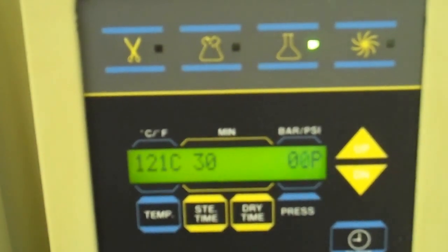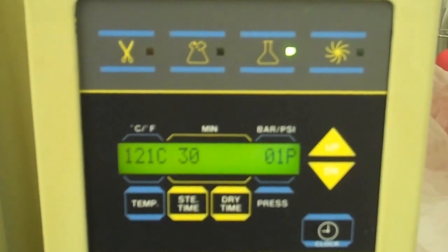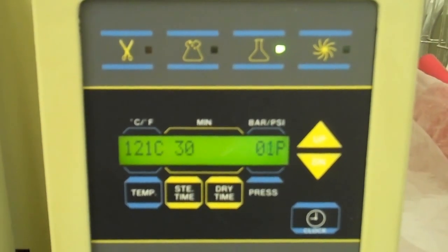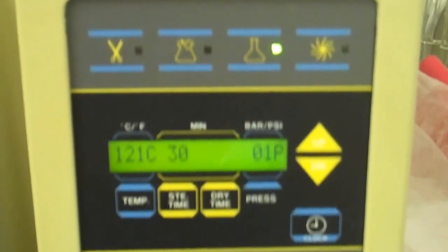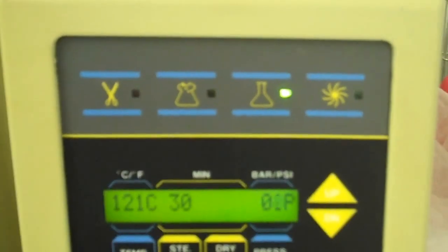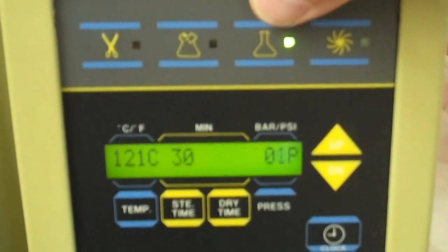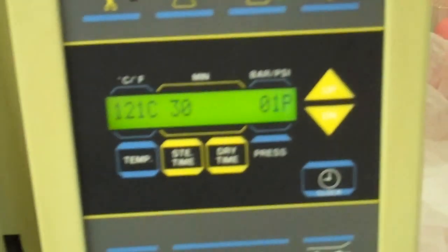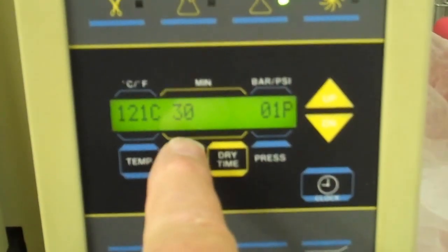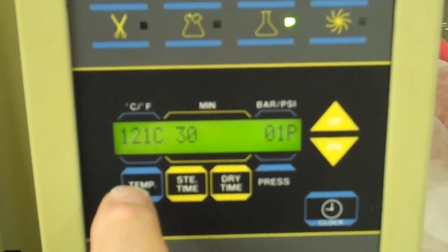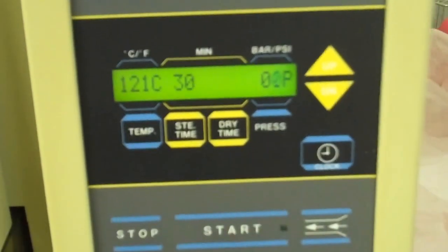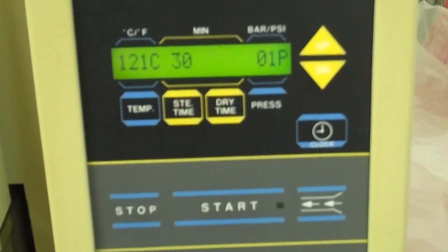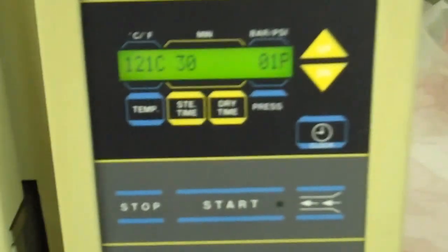We can actually use this cycle for bio waste, which makes it very simple. You just use the flask button. The time is set for 30 minutes, which is the correct time, and 121°C. When you want to start, you hit the start button, but since the door's open we wouldn't do that.